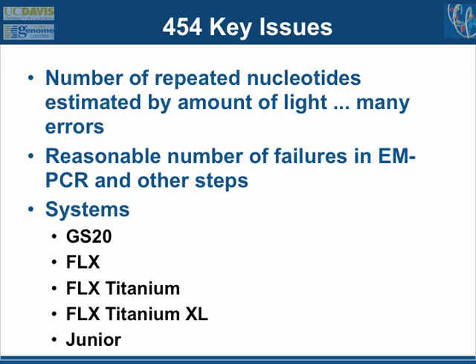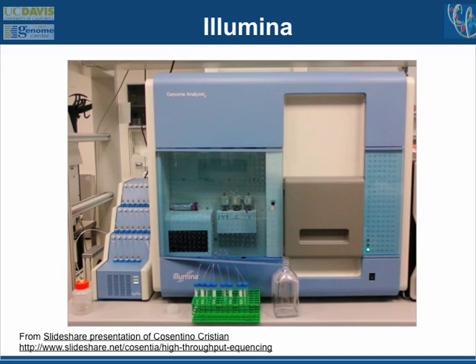And the cost per reagents is, it does 1/10 as many sequences for 1/8 the cost, or 1/5 the cost. I mean, it's more expensive per base pair, but it's a little more manageable in terms of the total amount of work and the amount of data that's coming out of the system. And I want to throw the machine away. But that we can get to at a later point. Are there any questions about the Roche methodology?